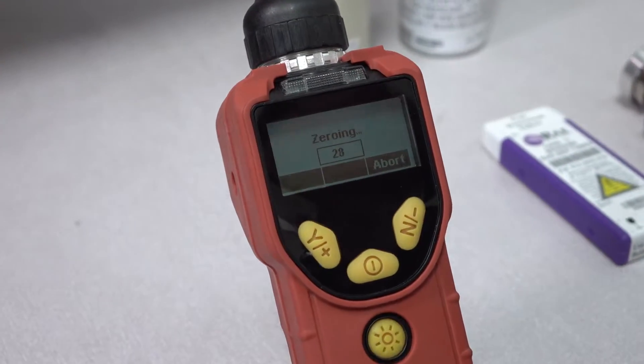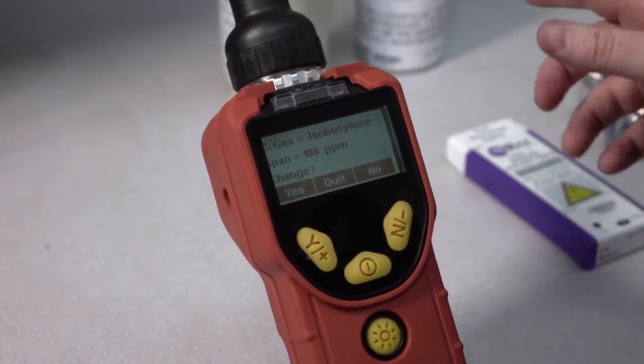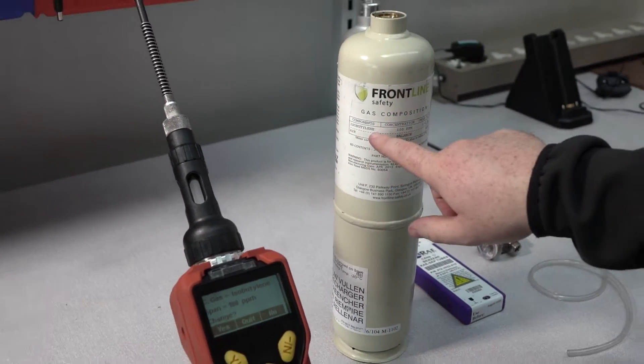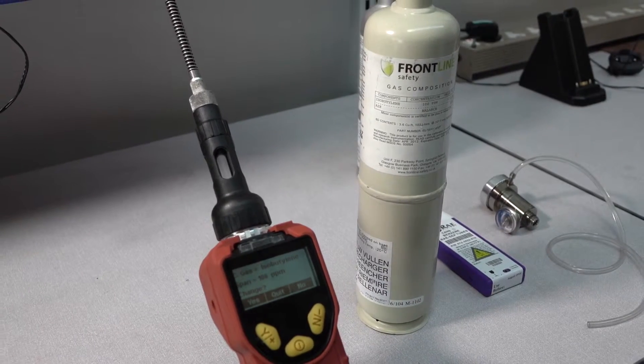The unit will now zero all sensors. Make sure that the calibration gas you're using contains the correct quantity of gas required by the device — in this case, isobutylene of 100 ppm.